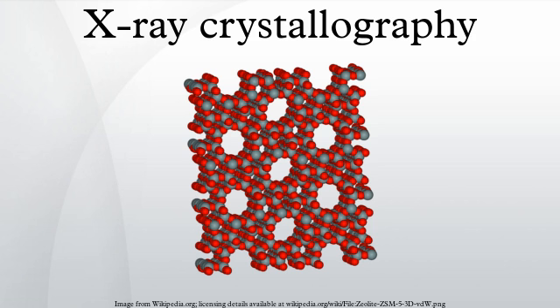Von Laue worked with two technicians, Walter Friedrich and his assistant Paul Knipping, to shine a beam of X-rays through a copper sulfate crystal and record its diffraction on a photographic plate. After being developed, the plate showed a large number of well-defined spots arranged in a pattern of intersecting circles around the spot produced by the central beam. Von Laue developed a law that connects the scattering angles and the size and orientation of the unit cell spacings in the crystal, for which he was awarded the Nobel Prize in Physics in 1914.